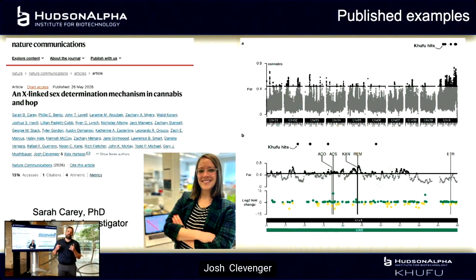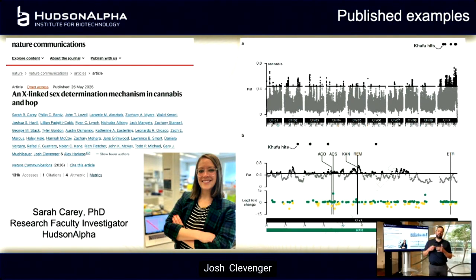And I don't want to just talk about the role of SkimSeq and pangenomes in my own program. I'd like to show some published examples that are exciting. Here's an example from Sarah Carey, who's here at HudsonAlpha, a really talented scientist, where she sequenced a very large backcross population of hemp and used a pangenome that she produced to understand sex determination in cannabis, and then was able to link that up to sex determination in hop as well.